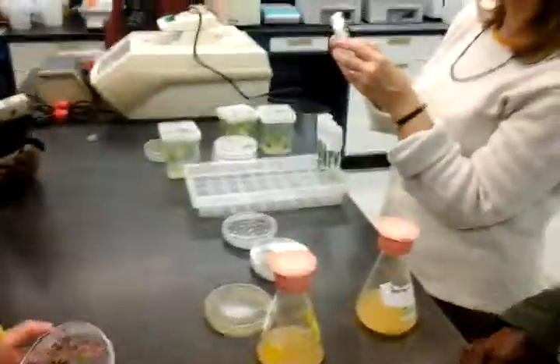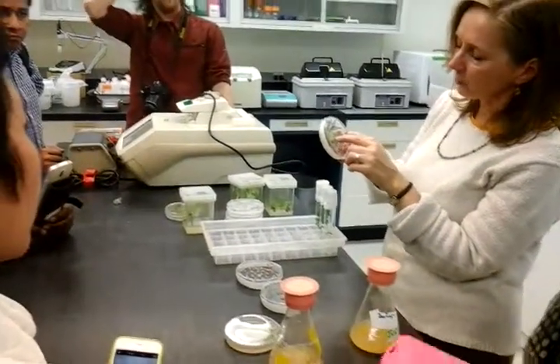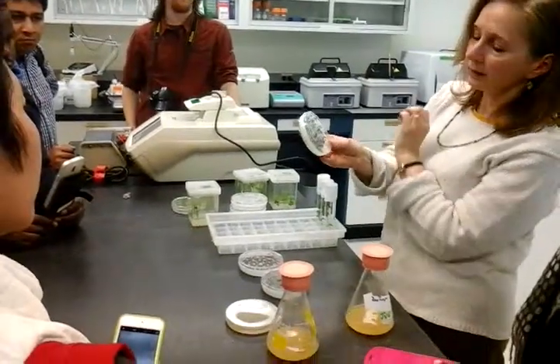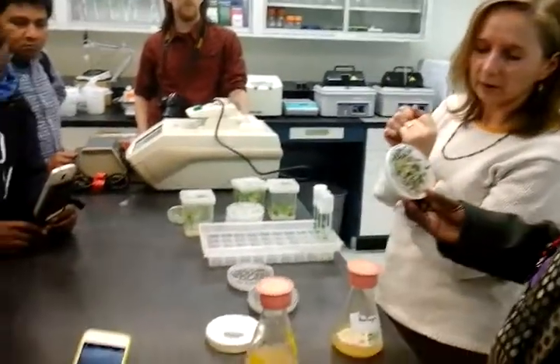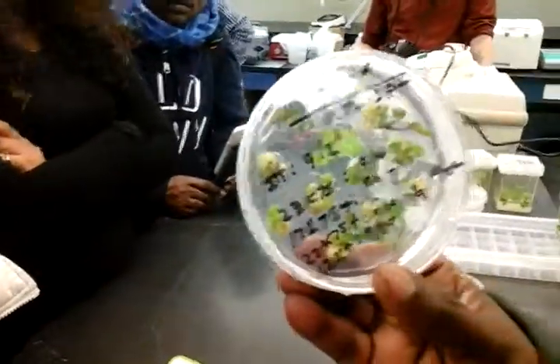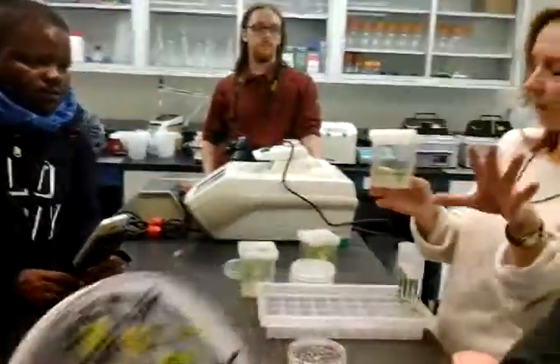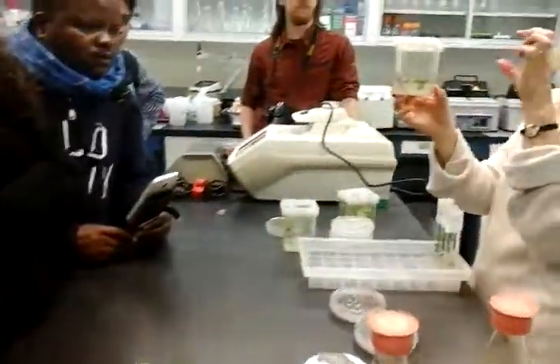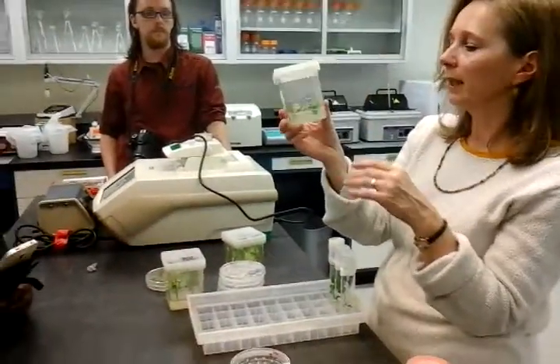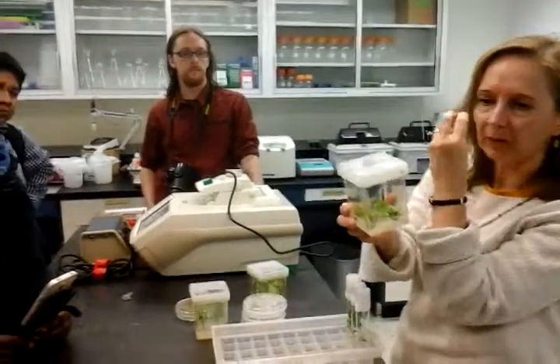This infection was done on September 2nd — so this is actually a transformation — and you can see that the plants are coming off. That one's a newer experiment. Once the plants start to get bigger, we put them in these boxes. It's the same medium that's in the plates, but as they get bigger they need more room, so we can see them in the plates and then they're progressing.